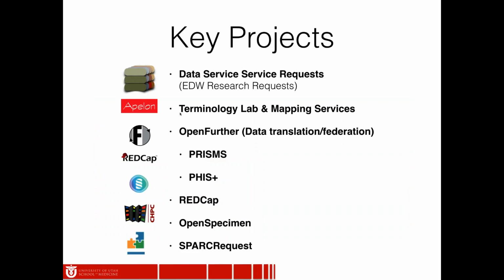So some of the specific ones that we're working on where OpenSpecimen fits in that, we're starting with a new next generation build of our data translation federation framework called OpenFurther, which will actually be in the end pulling data from OpenSpecimen along with patient-generated or captured data from REDCap for clinical trials, along with clinical information from our enterprise data warehouse.